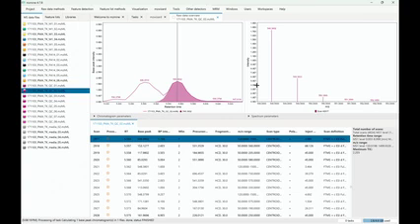We try to warn you, right? Sometimes we also don't know, because if the metadata doesn't tell us if it's profile or centroid, we have to analyze it and find out. But still, you can just zoom in on the spectrum. I can hold control and move the mouse wheel. And if there's really just one line and never a peak shape to be seen, it's already centroided. And that's what we did here.